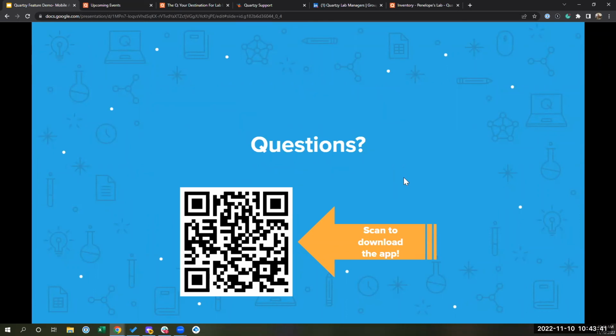So Samantha, do we have any lingering questions? Yes, we do. Thanks for asking. So this first question, it says, can you upload the OM barcode and be able to use that to check in items? So I'm assuming they're talking about their own generated barcodes. Can they use those to check in items? Yes, absolutely. So if you've generated your own barcodes, if you are using them to associate to your serial number of an item, you can just scan those directly in the app.